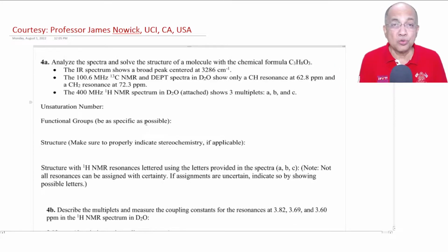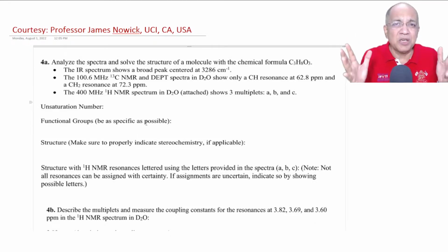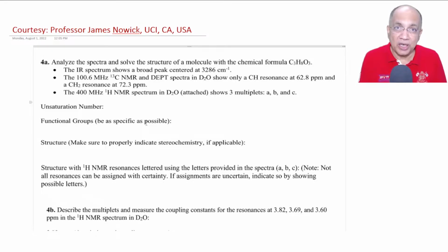Let me tell you, those who are watching who are not advanced level students, graduate students or PhD level students, and do not know about DEPT: distortionless enhancement by polarization transfer, that experiment is conducted to know how many CH3, CH2, CH carbons, that is methyl, methylene and methine, and quaternary carbons are present.